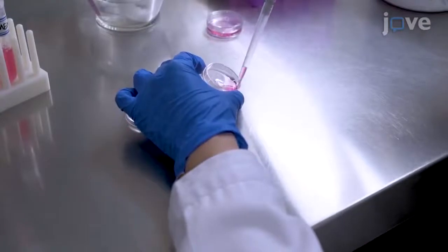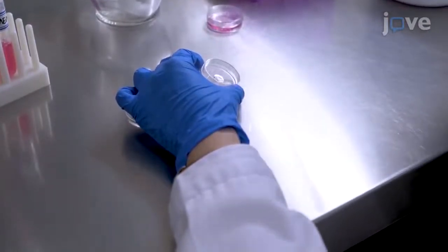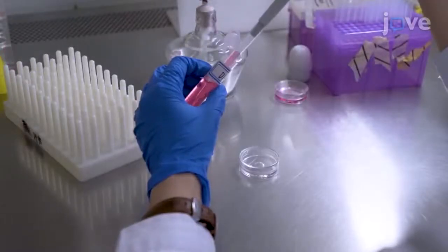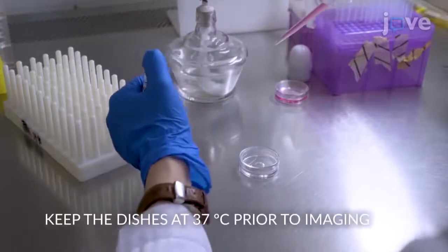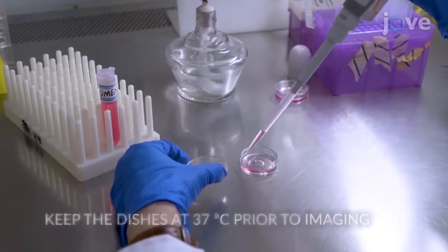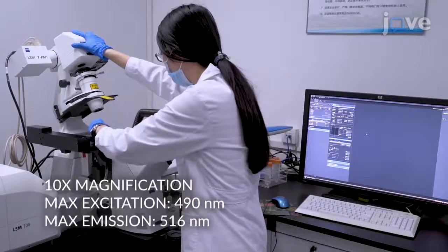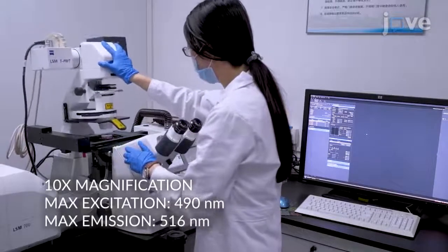After incubation, remove the mitochondrial green fluorescent probe solution from the cells. Add 1 milliliter per dish of freshly prepared 37 degrees Celsius DMEM cell culture medium. To detect green fluorescence in mitochondria, observe the cells under a confocal microscope.